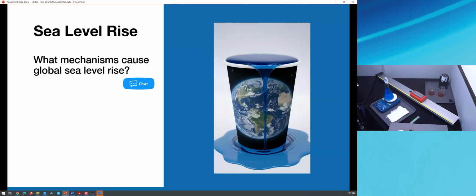As promised for this final activity, I'm going to be using a Chromebook. So let me bring up my Chromebook screen. All right, Christian, CO2 might be contributing. Darren, thermal expansion. All right. Any other thoughts? Yeah, temperature increased by CO2, air.